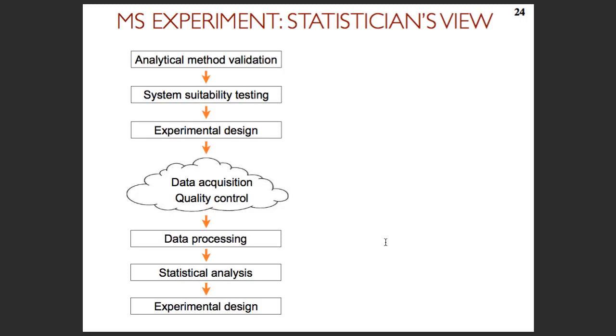As long as they export data in a format that we can parse, that's all we need, right? So we don't necessarily need to know the algorithms they use to quantify peaks, identify peaks. As long as their export formats can be read by something, we can work with that. So for Protein Discoverer, we have converters to some extent, right? So it's not like mass spectrometry vendor software where you need to have access to their API. So we work already in an R readable framework.